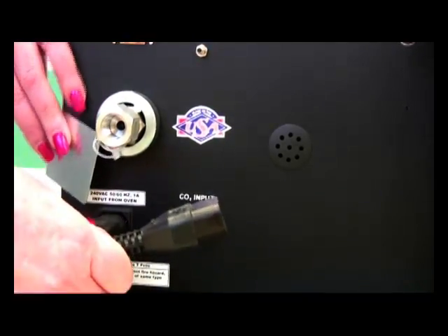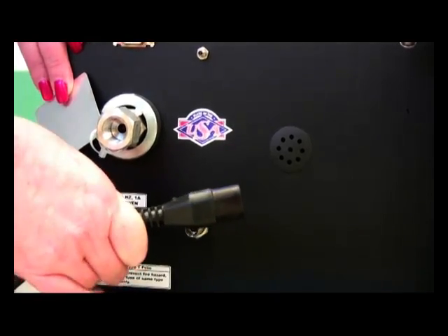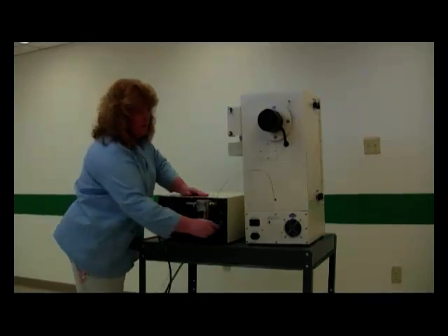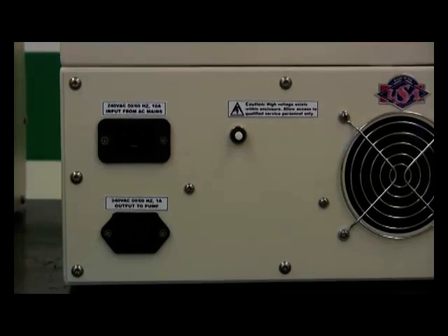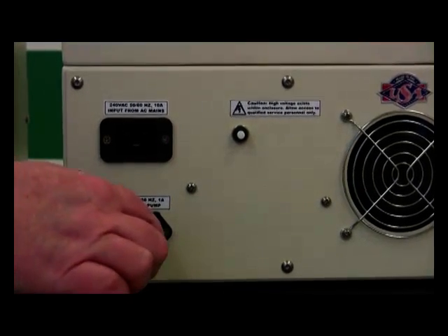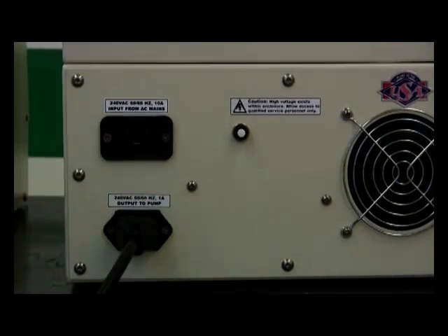Plug the smaller end of the power connection cord into the back of the pump, then plug the larger of the two ends into the back of the oven. This connects the power to the pump from the oven.